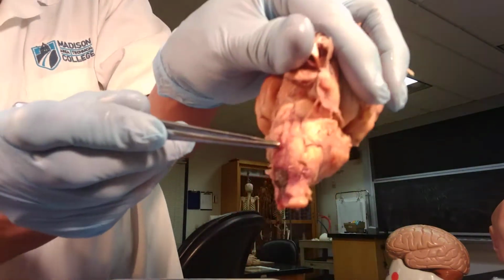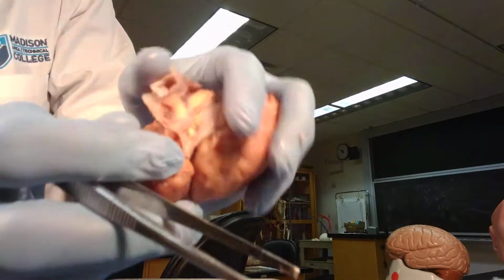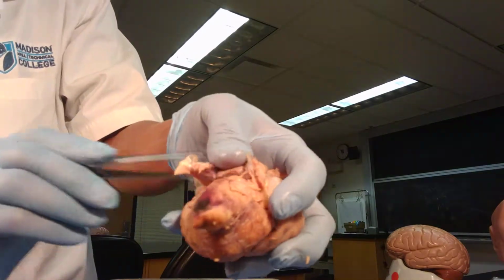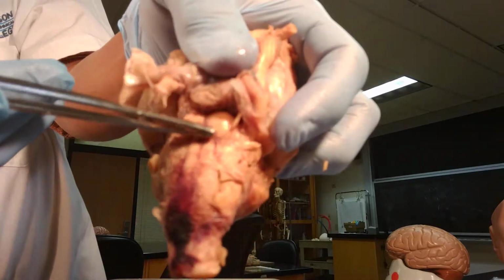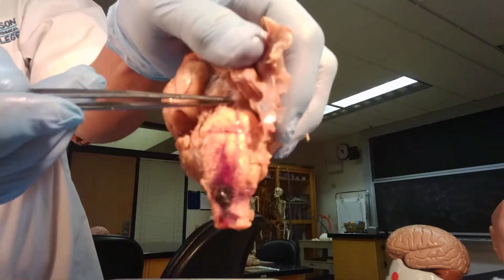This is the pons. Lift that up a little bit. This is the pons. The midbrain is right here.